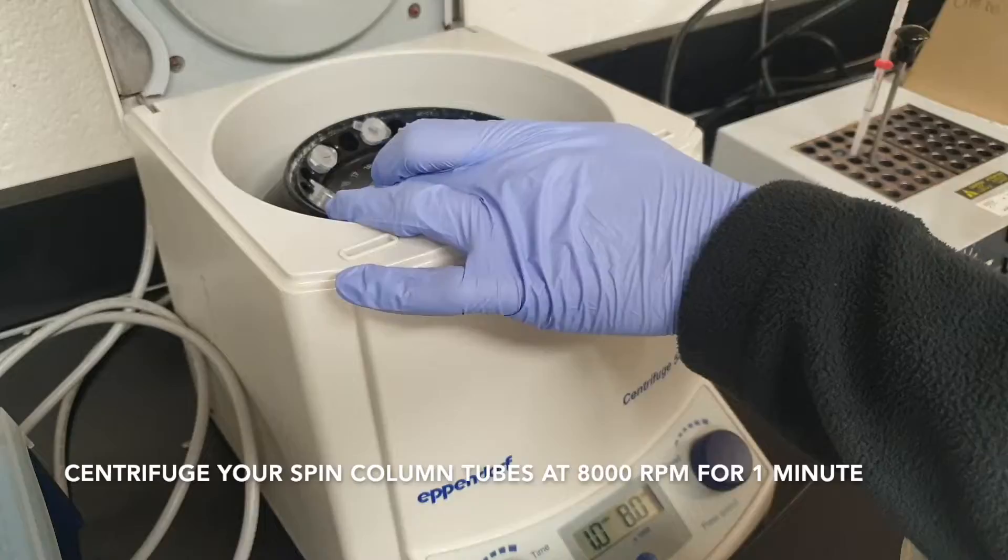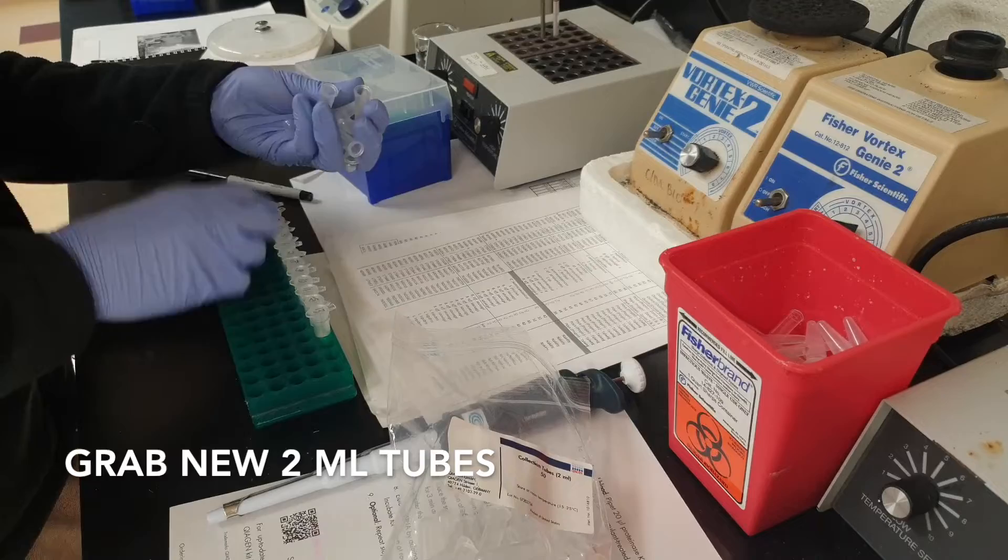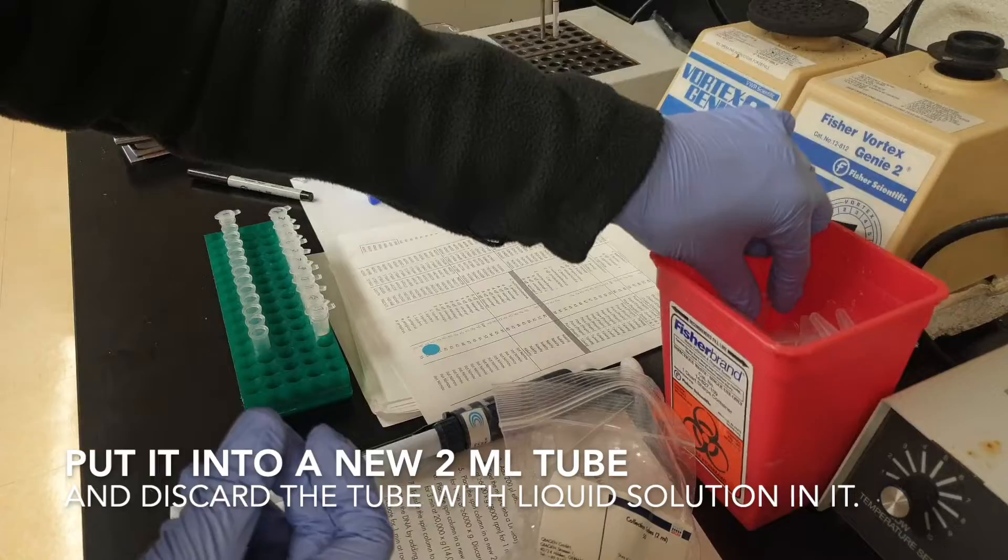Centrifuge your spin column tubes at 8000 rpm for about a minute. Make sure there's no liquid above the spin column; if so, just repeat the process. Grab new 2 ml tubes, remove the spin column, discard the flow-through, and place them into new 2 ml tubes.